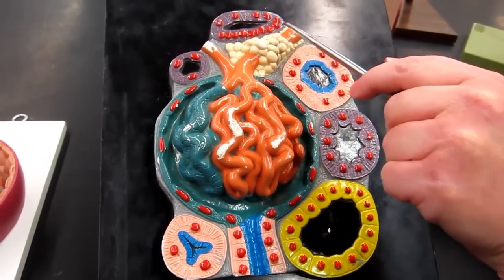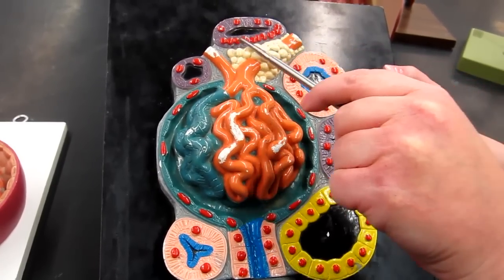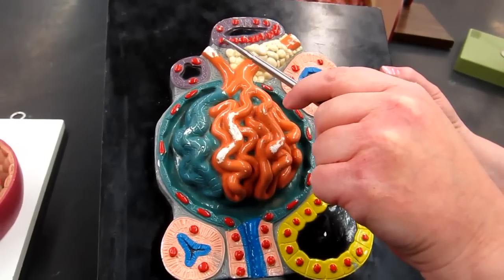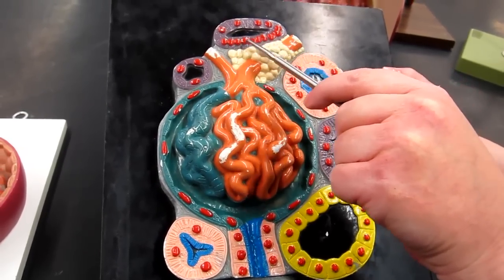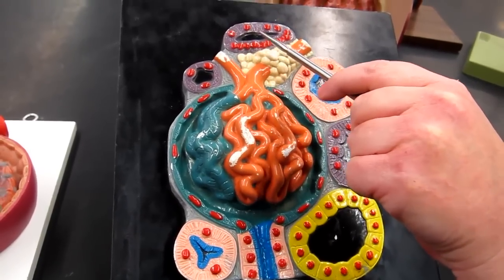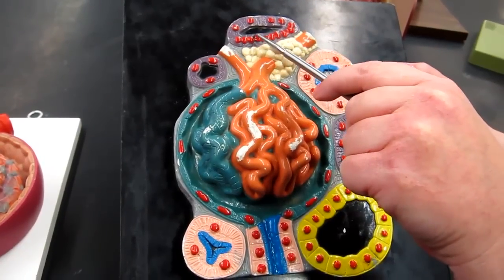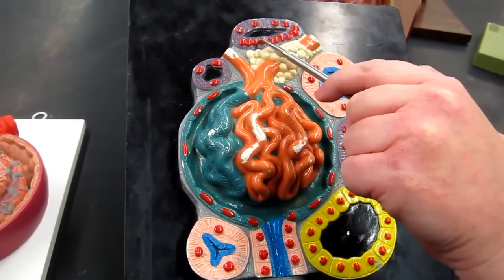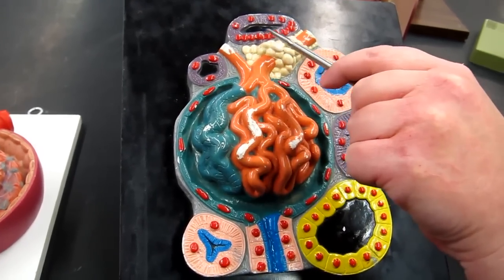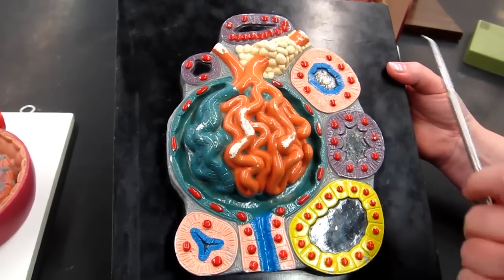Up here is that part of the loop of Henle, that ascending limb that we were looking at a few minutes ago, and where all these nuclei look like they're crowded together, that's where the macula densa would be. Okay, so the macula densa is one of the intrinsic regulators of glomerular filtration rate, and it uses chemoreceptors to get information on what it needs to do as far as regulating GFR.